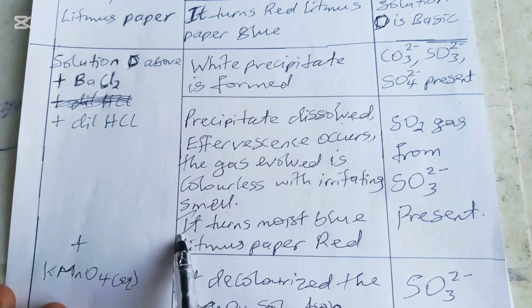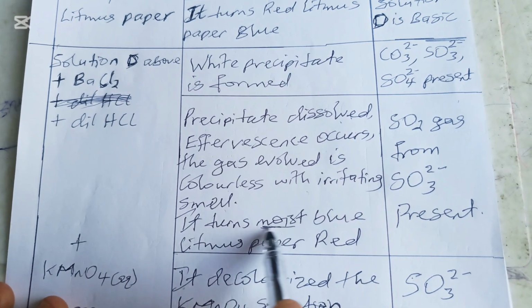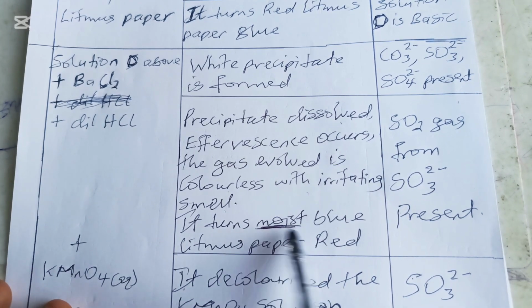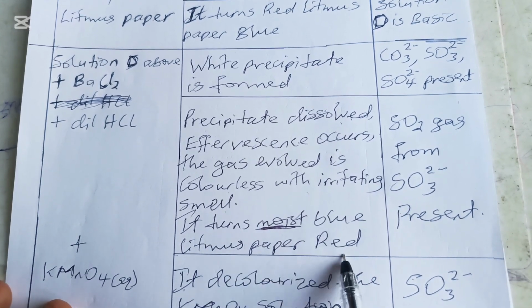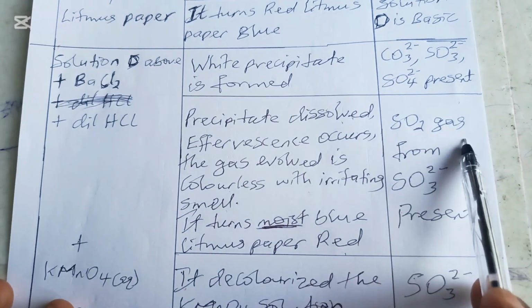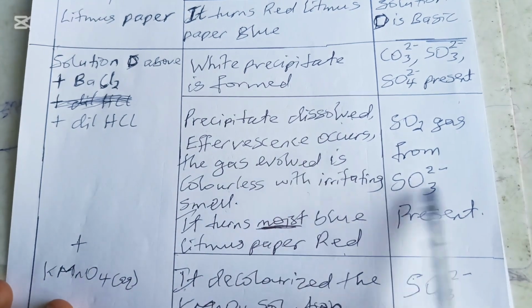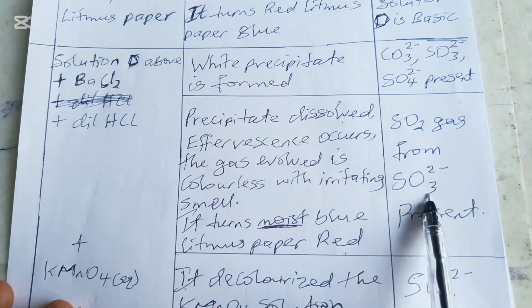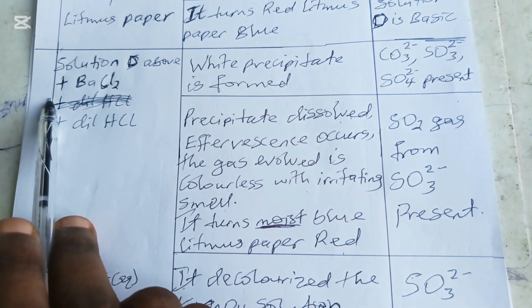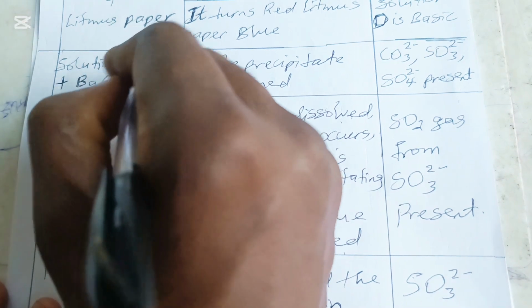Now, you now tell us that it turns moist, moist must be there, or damp. Because when you are testing for gas, the litmus paper must be moist. It turns moist blue litmus paper red because it is acidic. What are we now inferring, please? SO2 gas from SO3 2 minus present. This alone you have like 4 marks there. There are 2 marks, this and this. You have to be very, very careful. I told you, make sure the labeling here is correct. Make sure your D is a solution, don't just write D.